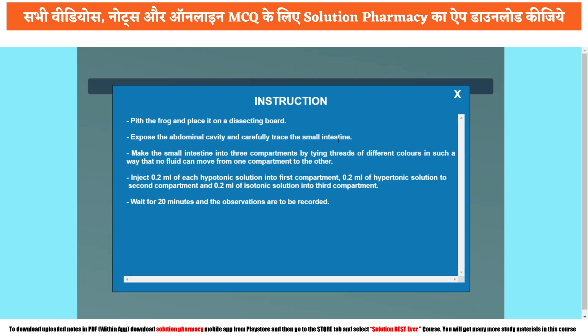Once after studying the objective, go to the instructions tab where you can collect the necessary information to perform the experiment. The first instruction is: take the frog and place it on the dissecting board, expose the abdominal cavity and carefully trace the small intestine. Next, make the small intestine into three compartments by tying threads of different colors for identification, in such a way that no fluid can move from one compartment to another.